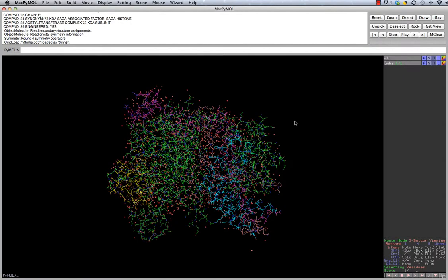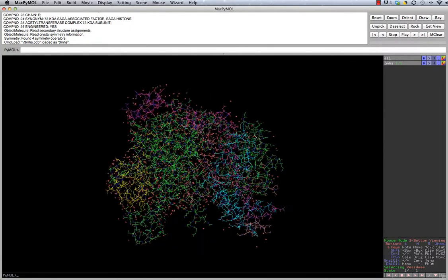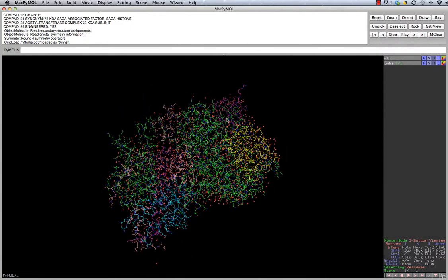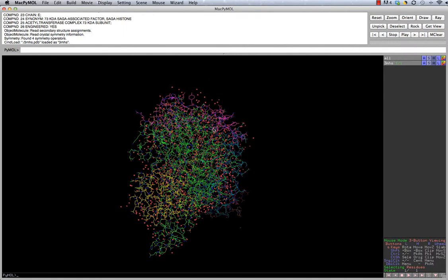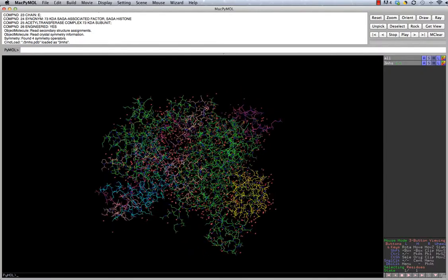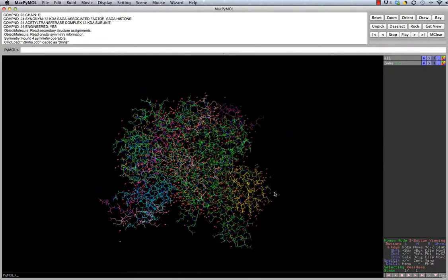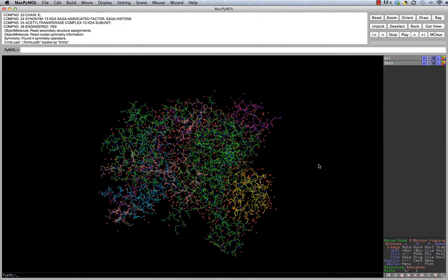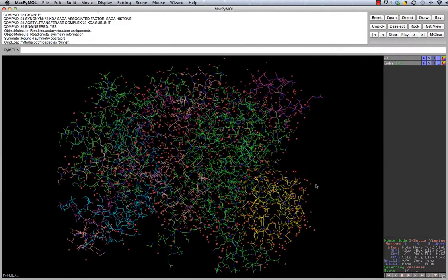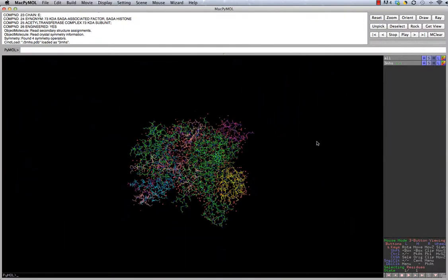So now we're back at the Pymol window, and to move this around, I'm holding down the left button, and now when I move the mouse with the left button held down, I move the molecule around. When I want to stop, I let the molecule go. Just play around with it, and you'll see that you can move these coordinates around, up and down and around. Now let's try zooming the molecule. That's with the right button. As I hold the button down, as I go up, I zoom in. As I go down, I zoom out.